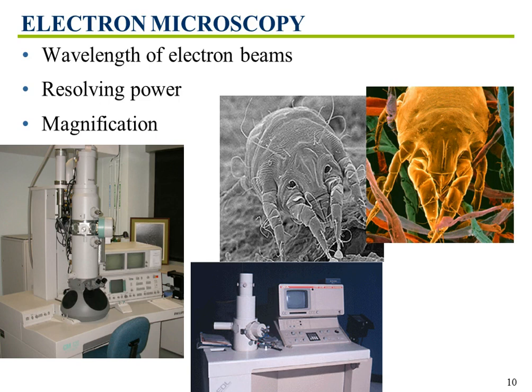The pictures you're looking at of the dust mites are EMs. The one on the left is black and white. EMs only take black and white, but you'll notice, for example, that on the pictures there are computers attached, part of the setup for the EM, and you can, as the user, tell the computer to color parts of things that you want colored. So most EMs that you see these days have been colorized because they're more attractive, and so the dust mite on the right is obviously colored.